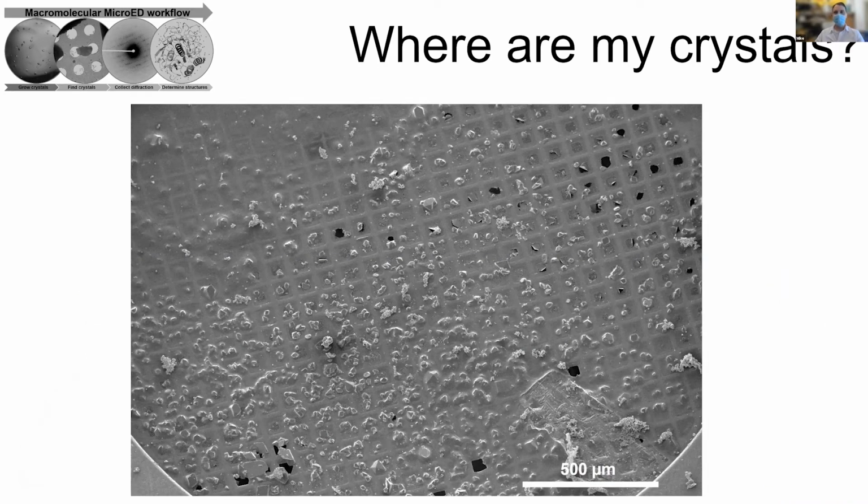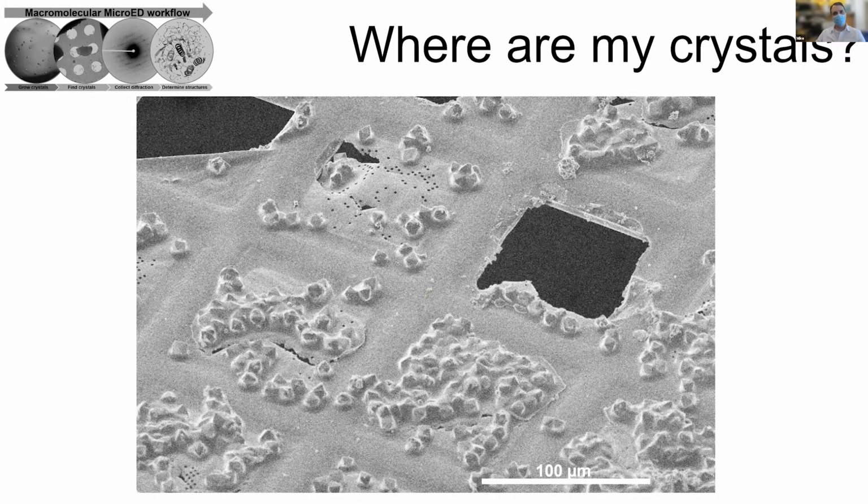We liked all that. And if you zoom in, you can actually see that our crystals are kind of like tortellini in a colander, being blotted and just sucked into where these little holes are and clumped together. But this was the problem, where these crystals were too big for MicroED. You can only have about a micron thick in your TEM. And these were 5 to 10 microns, which still made them a pain for X-ray diffraction.